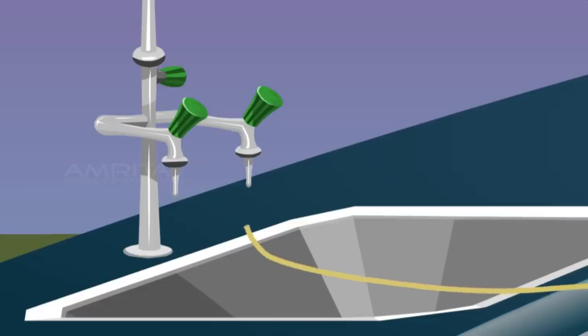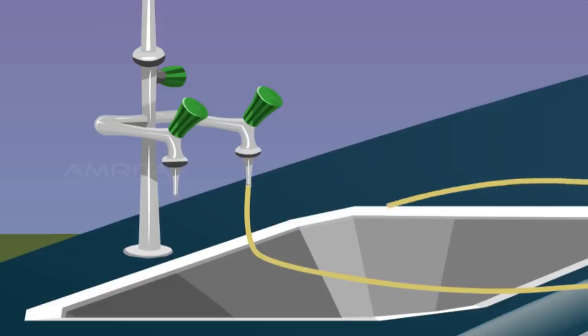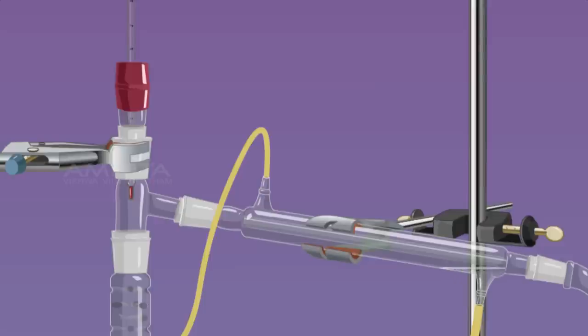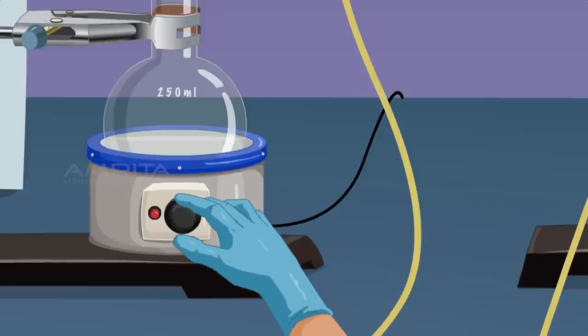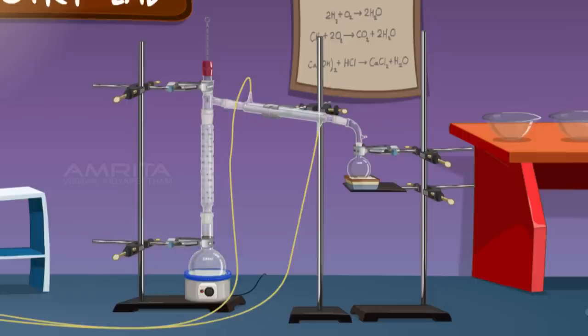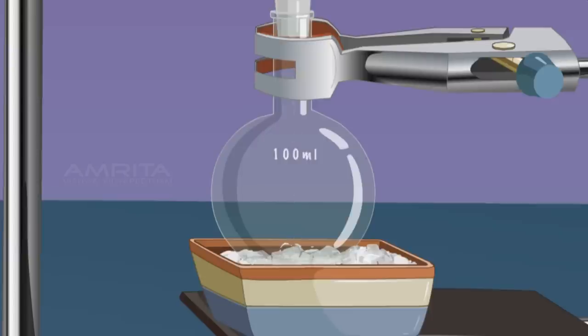Connect a rubber tube between the tap and the inlet of the condenser to allow cold water to enter. Connect another rubber tube to the outlet of the condenser to pour the hot water from the condenser to the sink. Open the tap so water flows through the tube and fills the condenser and then comes out through the outlet. Set the temperature of the heating mantle to 65 degrees and heat the mixture to boil. At 65 degrees, methanol vaporises and the vapours first rise through the fractionating column and pass through the condenser. Condensation occurs and methanol is collected in the receiver flask in liquid form.